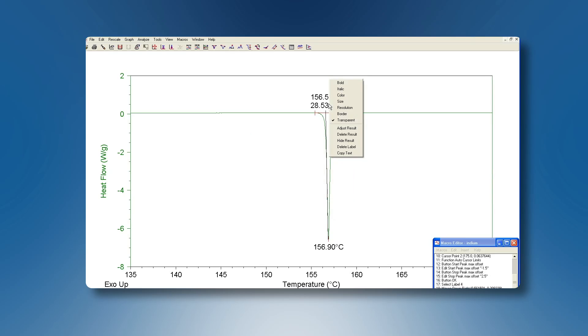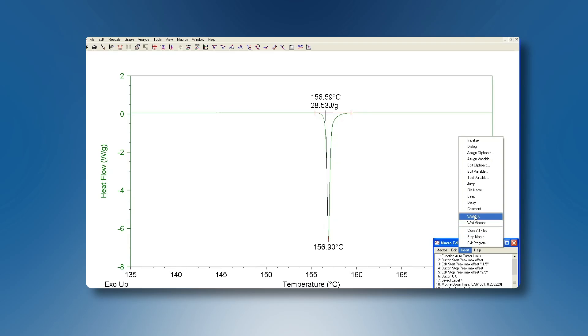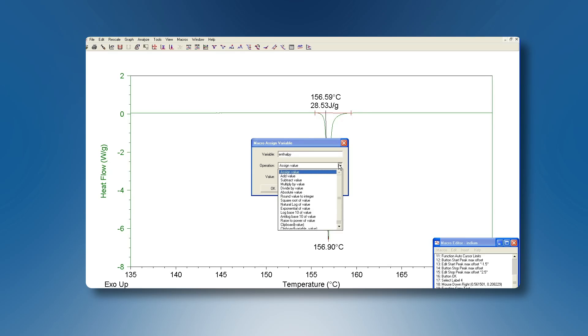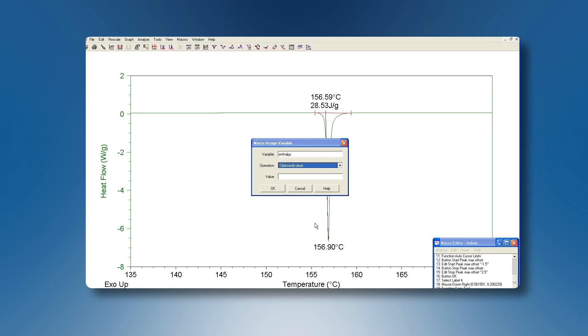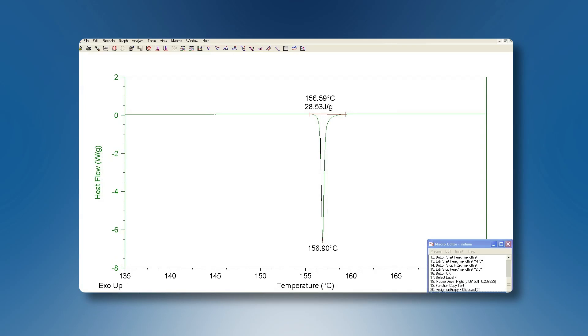Select now the label that contains the integral value and copy it to the clipboard. Now under the Insert menu, assign a variable to it. Let us call this variable enthalpy. We want to assign to it the value that has just been copied to the clipboard. The first value on the clipboard is the onset, so we need the second value being the melting enthalpy. This variable we now want to test.